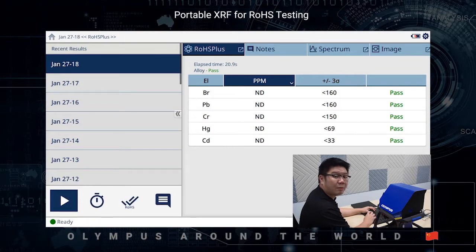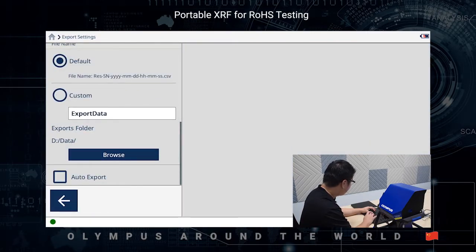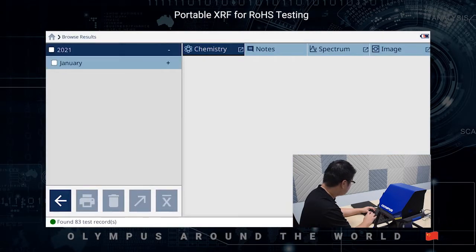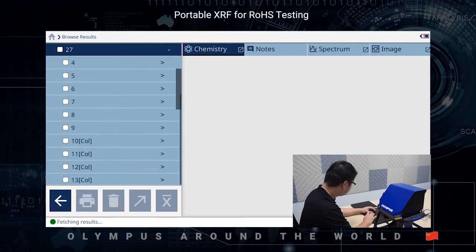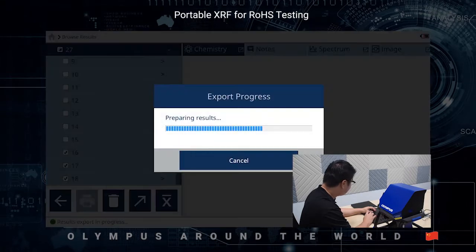Once the analysis has been completed, all you need to do is go to the export setting. Make sure the correct export folder is being chosen. Go back, go to browse results, select the data that you would like to export, and click on the export button.